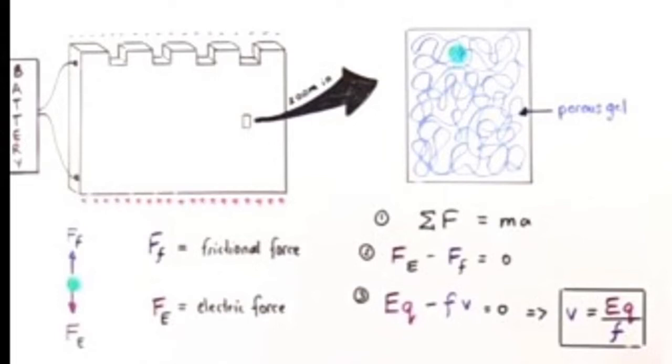So that implies that the E, where is the marker? Okay, just a bit. So from electromagnetism, we know that if we have a charge inside the constant electric field, the force will simply be the electric field.